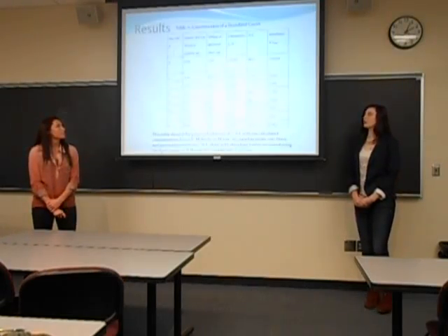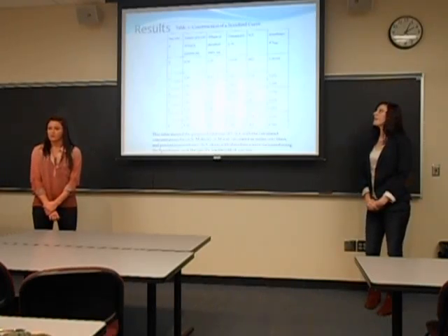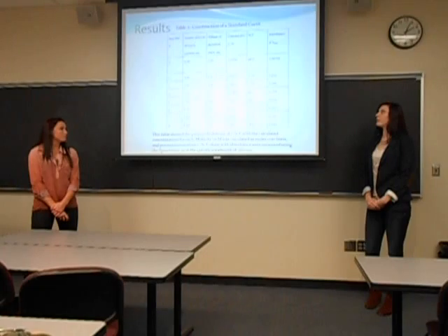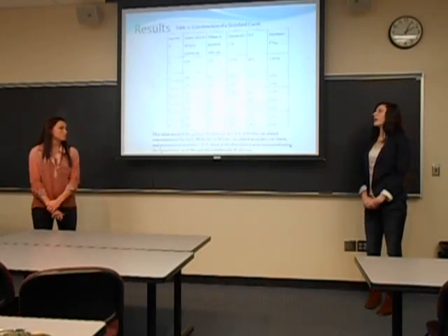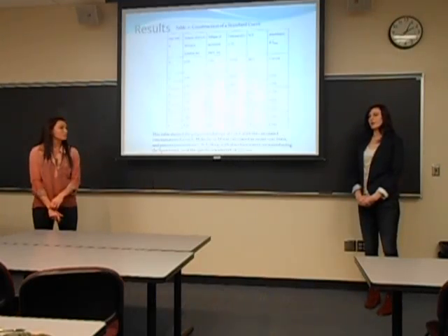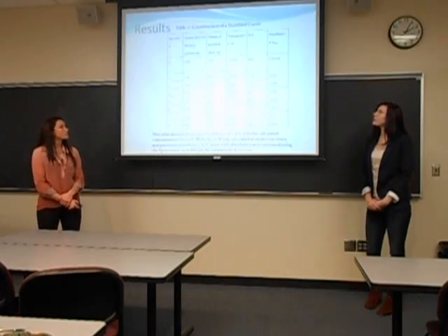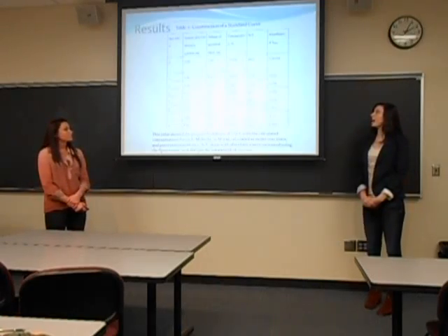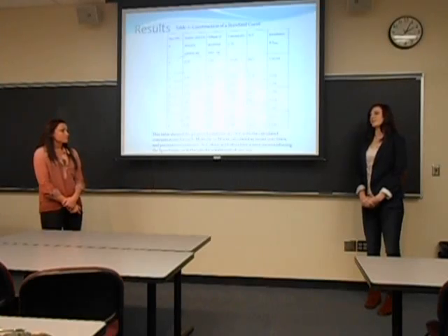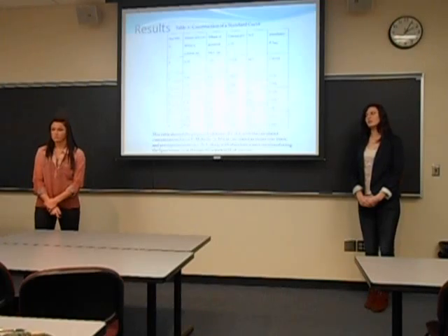This is our table 2, which was displaying our different concentrations determined in the pre-lab, and our 8 dilutions, the volume of how much cobalt chloride was used, and how much water was used in each test tube to create the dilutions. And then from each test tube, we used the spectrophotometer to determine percent transmittance, which is shown, and the absorbance. We can see the direct relationship between concentration and absorbance, seeing that as absorbance increases, concentration also increases, but as percent transmittance increases, absorbance decreases.